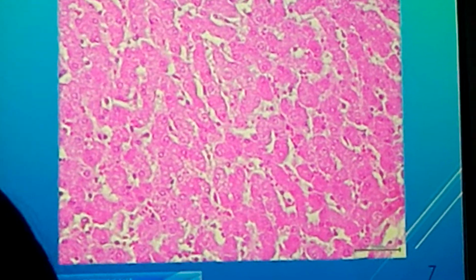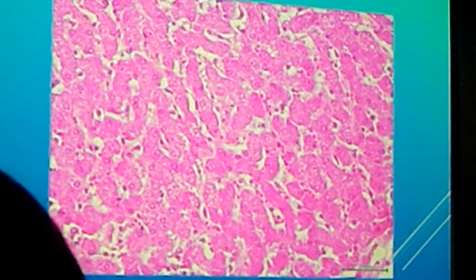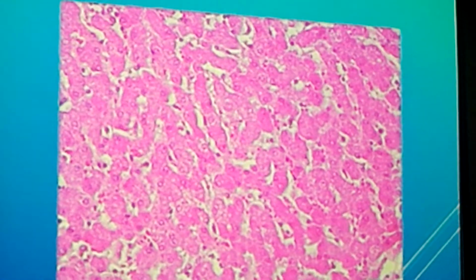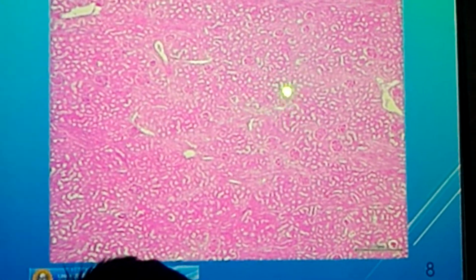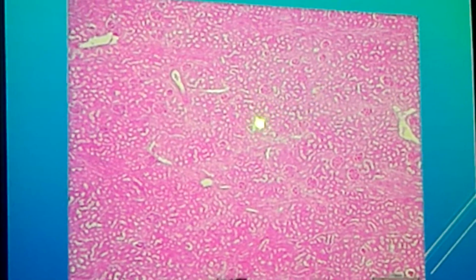Remember when you take the practical exams, when you have the history, usually meron drawing beside the microscope. If the drawing does not match with what you see in the microscope, just raise your hand. Okay? This is a common mistake. To the very end of the first year, students are still confused differentiating this organ from the pancreas.